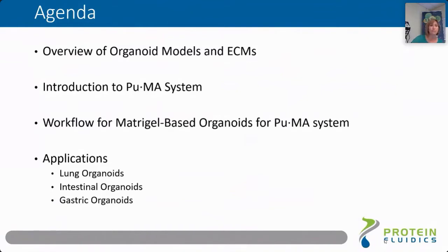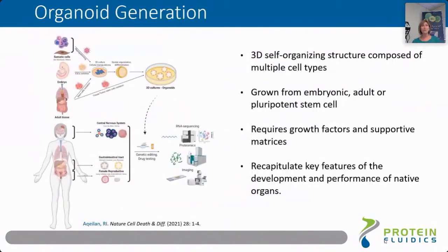So when I was looking for the most appropriate and the most accurate definition of organoids, I came across a very interesting review, and one of the authors was Mina Bissell. And they say that organoid definition lost the precision. And indeed, if you talk to different scientists, the way they define organoid would vary a lot depending on the subfield that they're coming from.